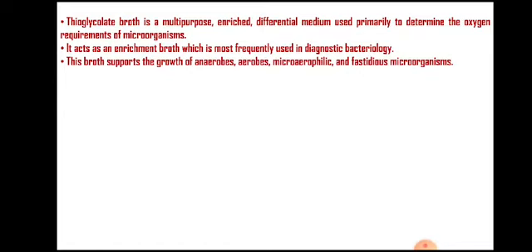We make use of different nutritional media that will allow the growth of aerobes as well as anaerobes. For allowing the growth of anaerobic bacteria, we make use of thioglycolate broth. Thioglycolate broth is a nutritionally rich medium that will allow the growth of anaerobic bacteria.